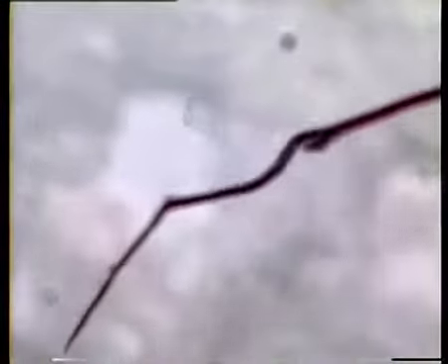Finally, the distal end of the artery is cut, and you can closely examine the vessel. If you see small narrowed regions of the vessel, like sausages on a string, you should avoid using these areas since they reveal the vessel is damaged.